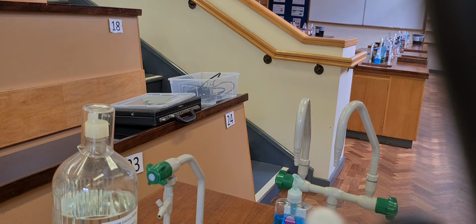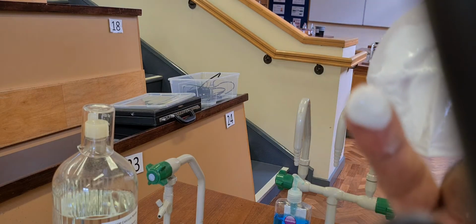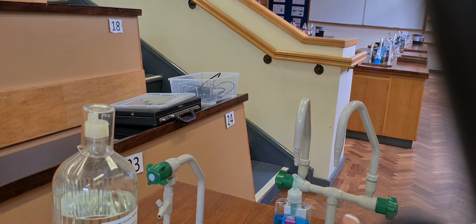There. See? Barium sulfate is a white solid, and it's there, and you've made it. So let's get back to the PowerPoint.